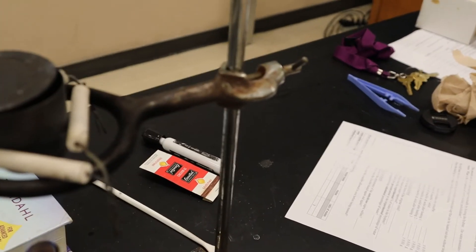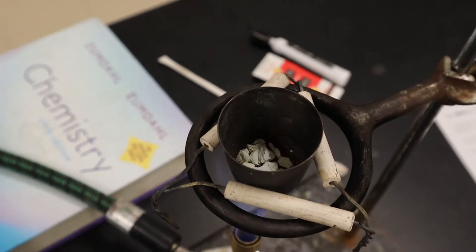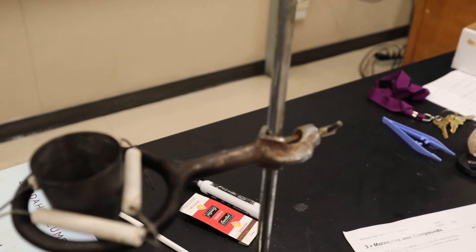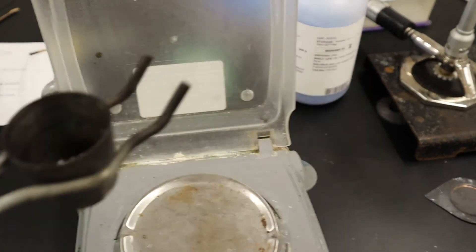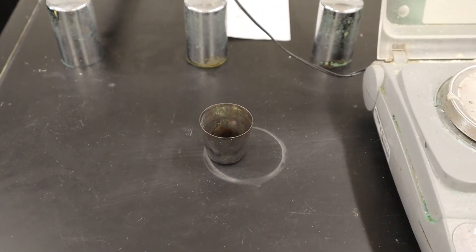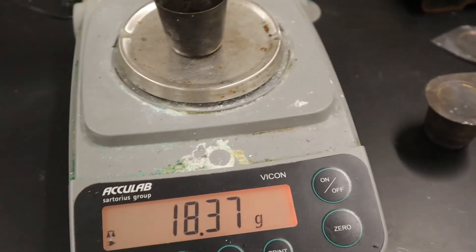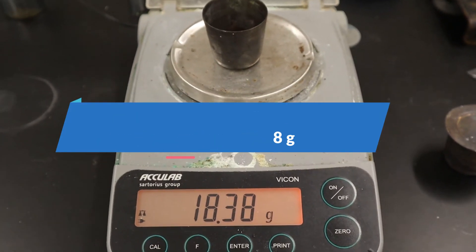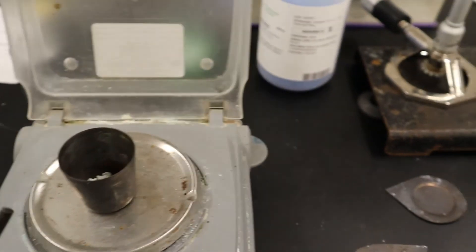I've been heating it for a while. Now I look and it's almost all white. I'm going to take it out with tongs and set it down briefly on the heat-resistant table to let it cool for just a few minutes. Then I put it on my scale and get 18.38 grams — that's the mass of the crucible plus the solid after the first heating. I make a note of that.